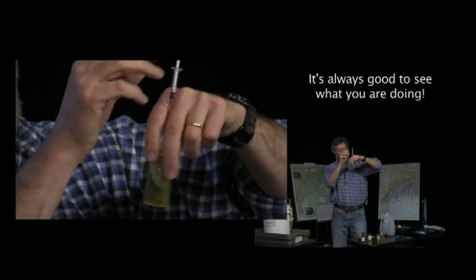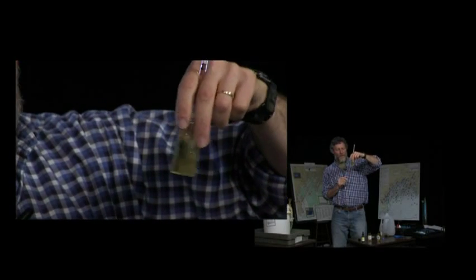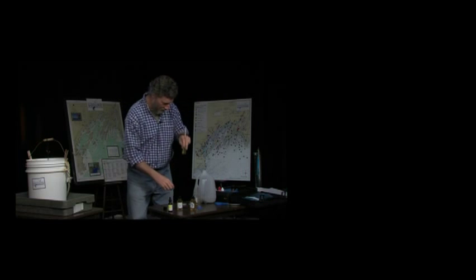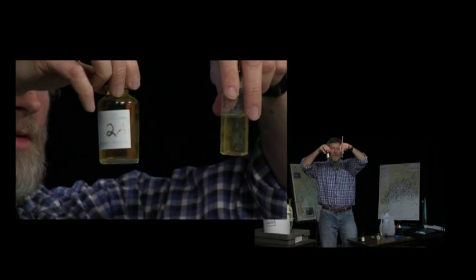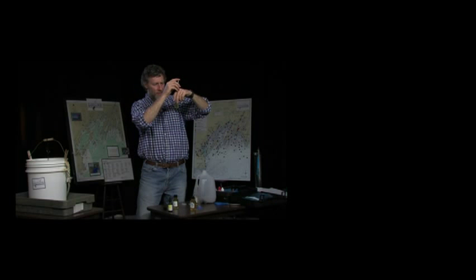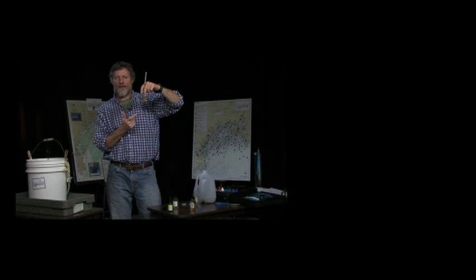So what I'm going to do is keep adding a drop at a time, swirl it up, just keep mixing it. And what I'm looking for is this sample to end up being a sort of pale straw color compared to what the original sample was when I started. So here's the original sample, and this is my new sample with some of the thiosulfate in it. It's a little bit more of a pale color. And I might go a little bit further to have a bit more of a pale straw color.